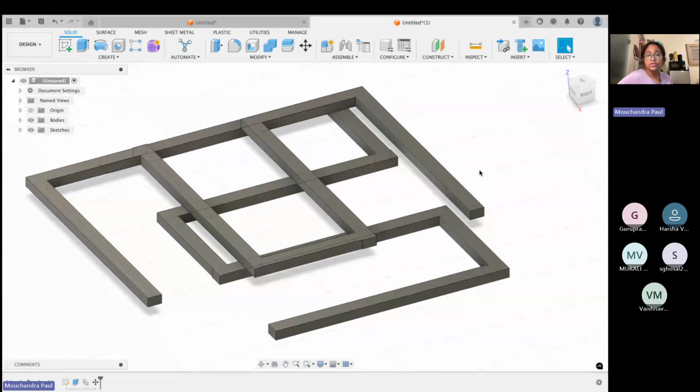But it's a very fun software. You can create anything, like any CAD model you want, any 3D object you want. Not only for 3D printing, but you can also create 3D art if you want, for your publications and all. So you can create those arts as well.